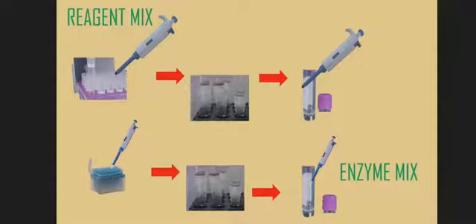Then dispense it into the cryotube and dispose of the filtered pipette tip because the viscosity of the enzyme may cause bubbles. After dispensing, put on the screw cap of the cryotube and label it with M, which means master mix. After every set of reagent, change your gloves, and after working in the hood, always disinfect with UV lights.